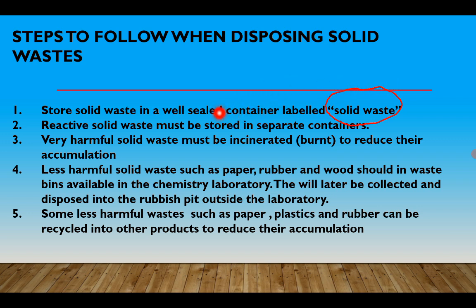First, the container should be one that can be sealed. Once the wastes are thrown into it, it can be sealed. It must have a lid on top.